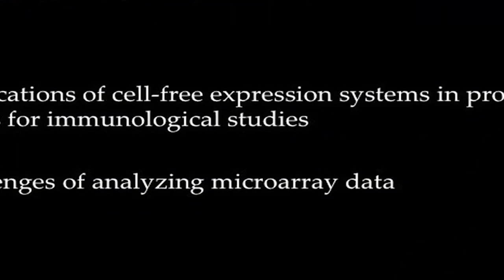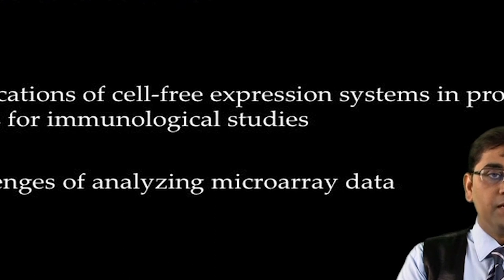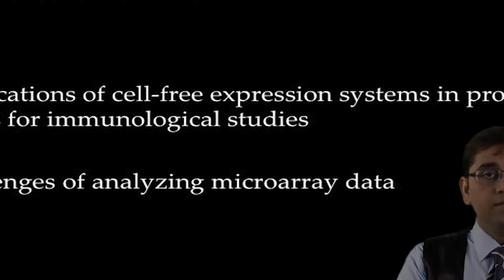We discussed this aspect in our previous lecture when we talked about the use of cell-free expression systems for biomarker discovery. Today we will continue our discussion on applications of cell-free expression systems and other biological goals they help us to achieve using a few case studies. Finally, we will also touch upon the challenges of analyzing microarray data, regardless of which experiments you perform and what biological questions you may want to address. However, the data analysis becomes very crucial and challenging in microarray experiments.